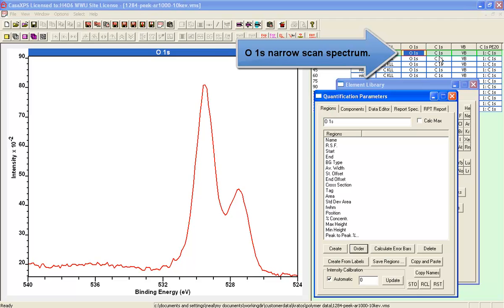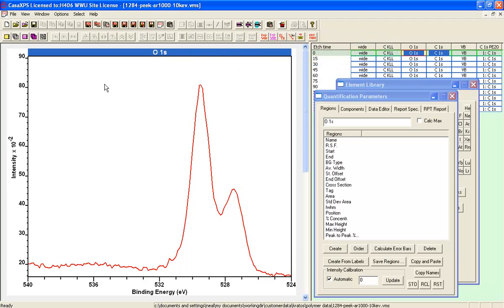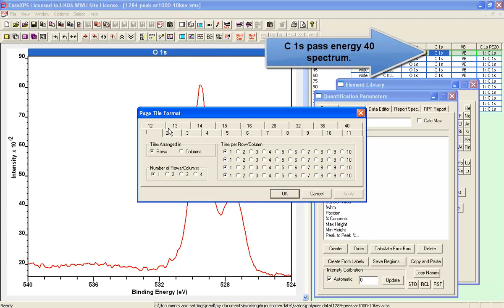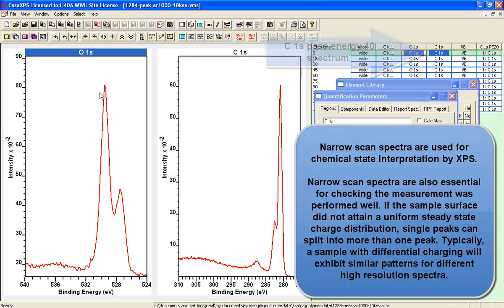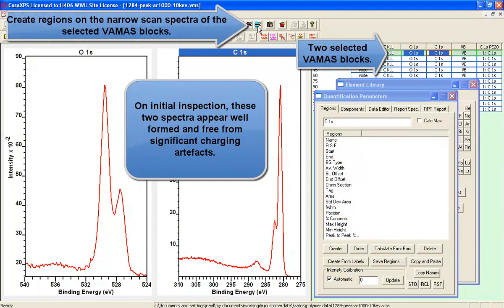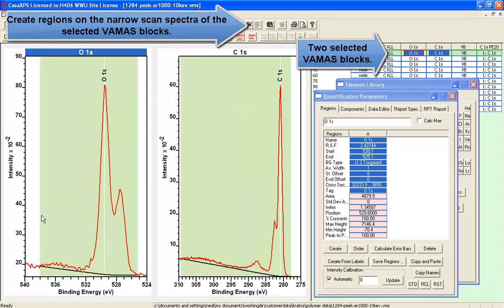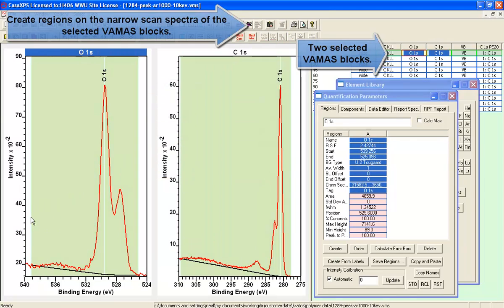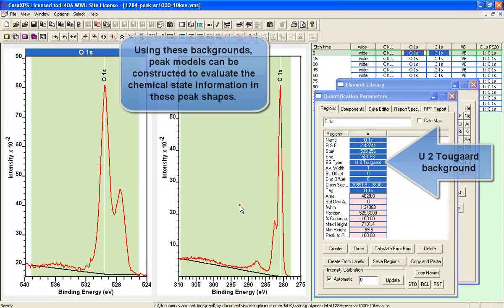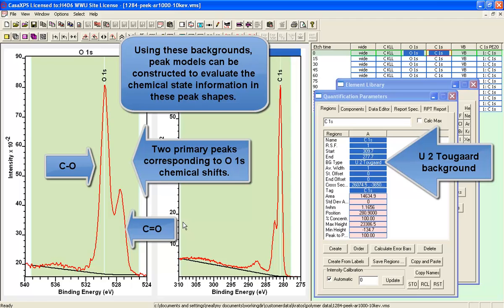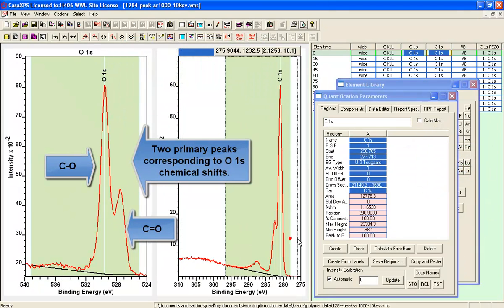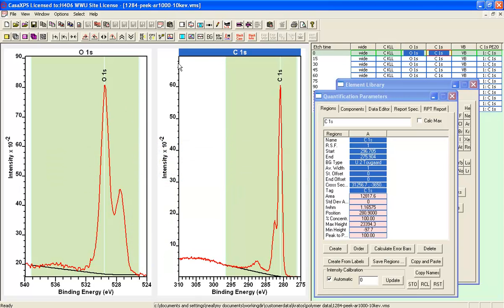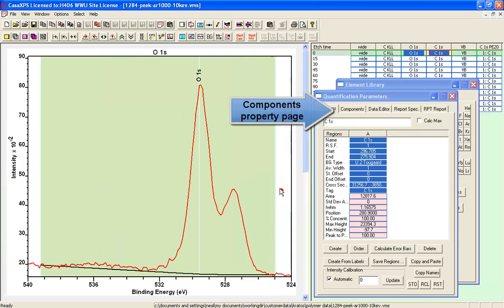When we look at the high resolution data, we can see shifted peaks, which is encouraging. Having measured both the oxygen and the carbon high resolution data, this not only shows us the potential chemical state information, it's also showing us that both of these spectra are well formed. We do not expect to see shifts in peaks due to anomalies in the measurement, such as differential charging. The peaks that we see are clearly shifted in different directions, so there's no systematic peak structure that might indicate we've got some problem with the measurement.